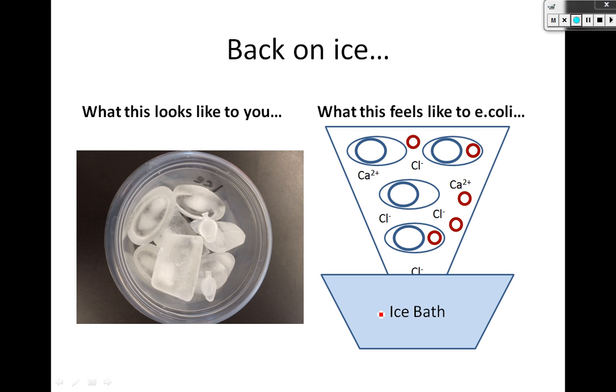So then we put it back on ice. So you'll have a little ice bucket that you've been using the whole time. If I can get crushed ice, I will. Not crazy about big cubes of ice for little tubes, but whatever. They go back into the ice. And now the E. coli is like, no, wait, hang on. Now we're back in the cold. What is going on? So not cool.